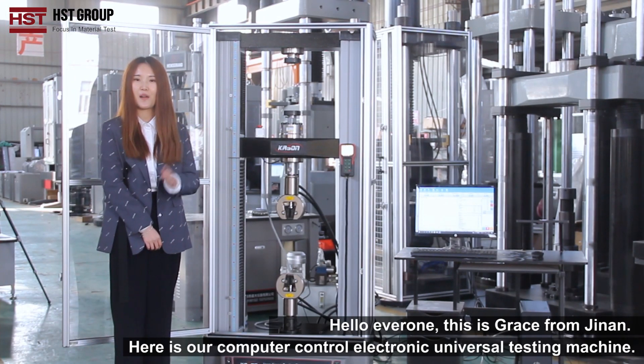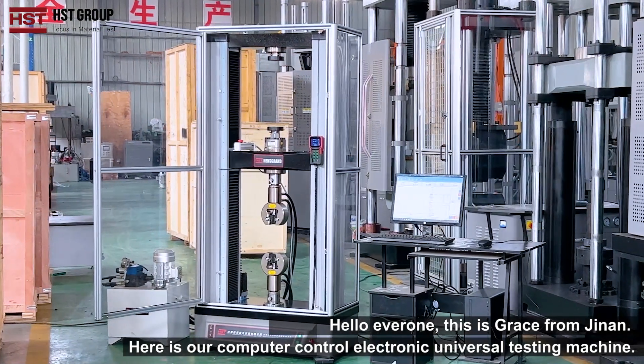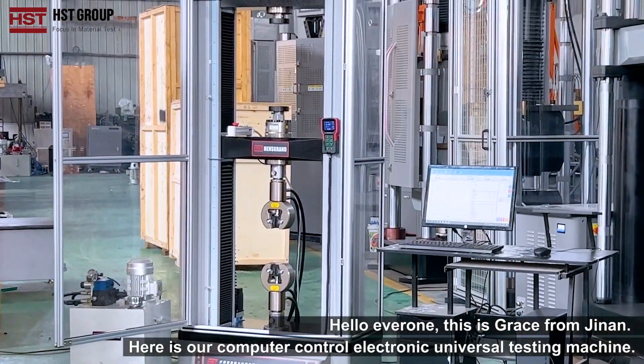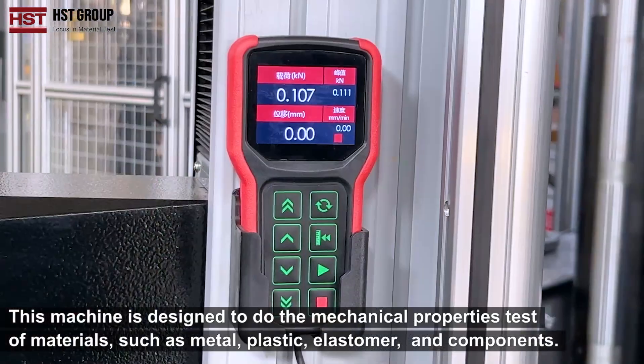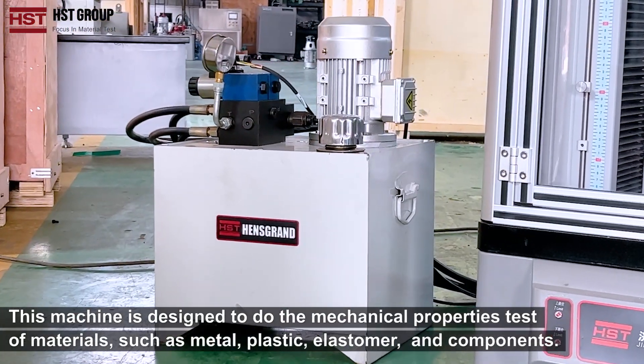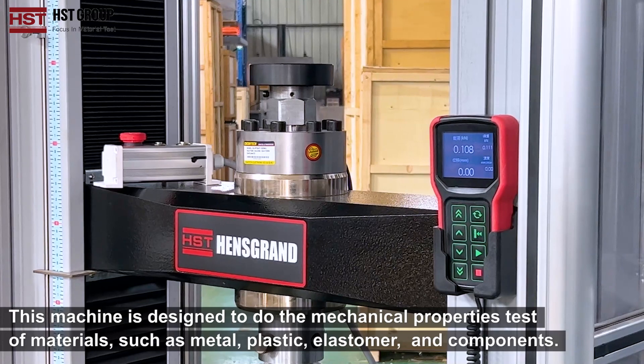Hi everyone, this is Grace from Jinan. Here's our computer-controlled electronic universal testing machine. This machine is designed to do the mechanical property test of materials such as metal, plastic, elastomers and components.